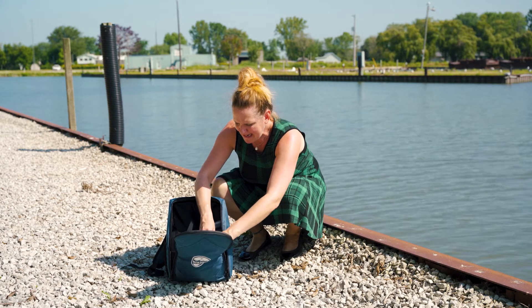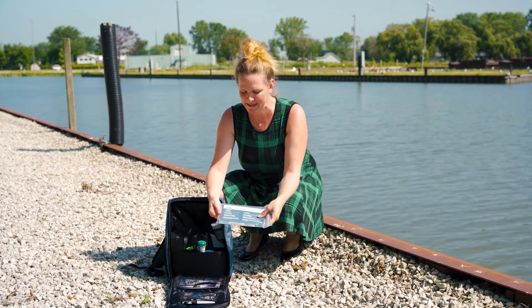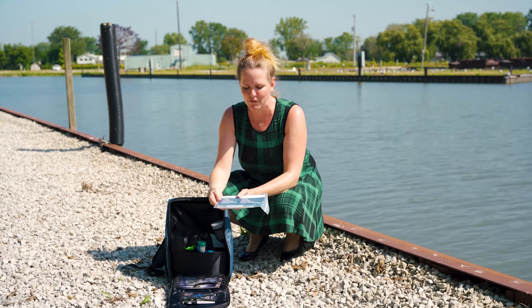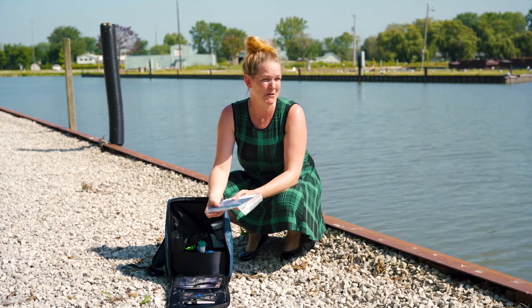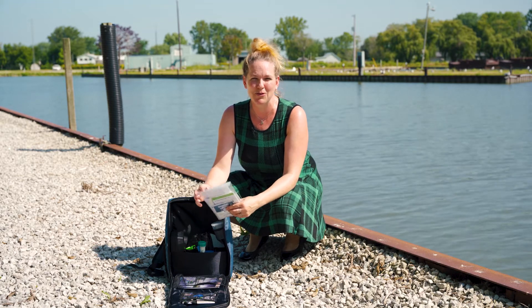Also in your bag, you're going to notice your goodie bag. You have a magnet to remind you of our monthly testing, an envelope to send us your used test strips, calibration solution for next season for your conductivity meter, as well as stickers, badges and postcards. You'll want to use those because when you go out, people are going to ask you what you're doing and you'll want to share the good work you're doing with those around you.